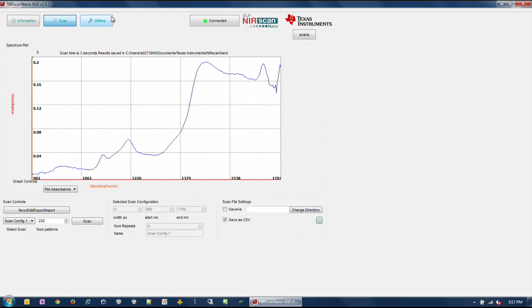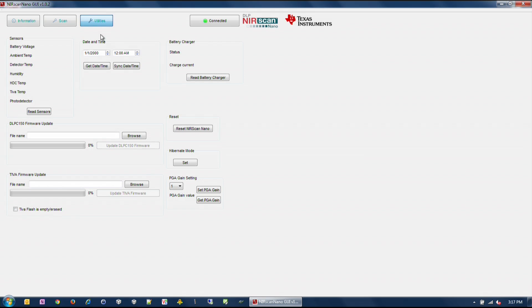The Utilities section displays sensor data such as battery voltage, ambient temperature, detector temperature, ambient humidity, and HDC temperature.